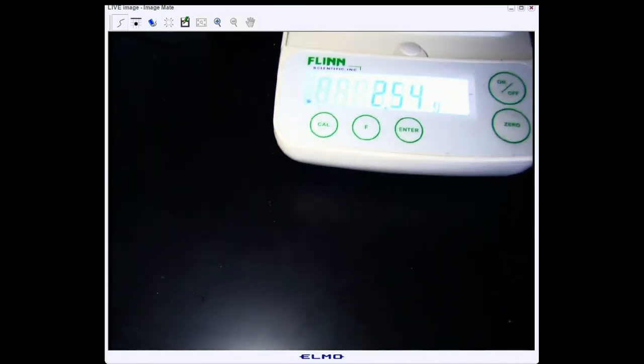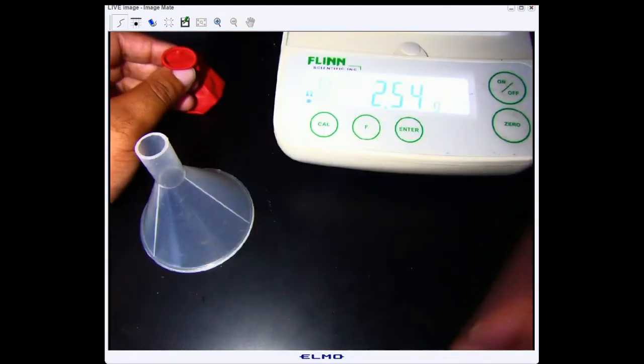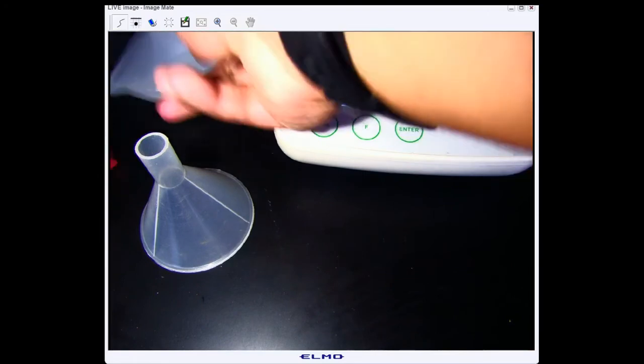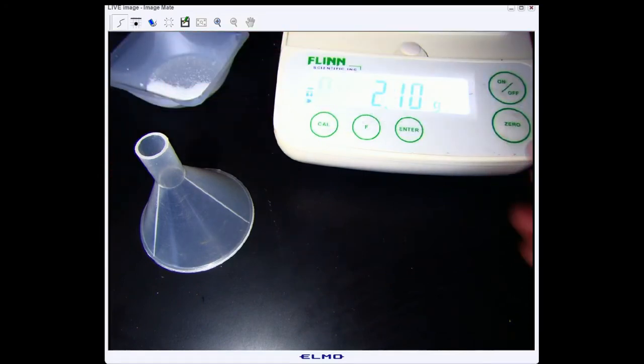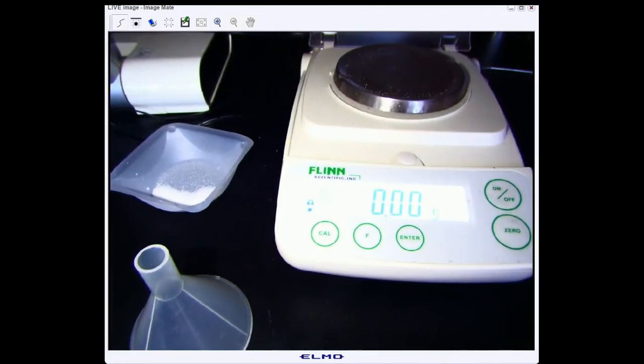Now we need to transfer our baking soda into our balloon. I'm going to take my balloon. Oh, I missed a step. We need to get the mass of the balloon. So we're going to remove our baking soda, re-zero the balance, and place our empty balloon on there and record the mass.